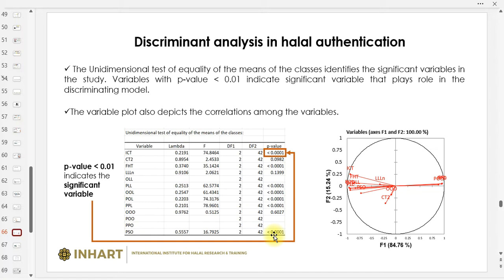It turns out that only 17 out of 100 variables, for example, or 30, are needed to monitor pollution in Malaysia. So we proposed to the Department of Environment, and we managed to cut costs for the government for monitoring pollution in Malaysia. Similarly, you have lots of variables. For example, in fatty acids, we have 37 fatty acids. But to differentiate between sources of samples, perhaps not all 37 are significant in our study, perhaps only 10. So instead of purchasing 37 fatty acid standards, just purchase 10.